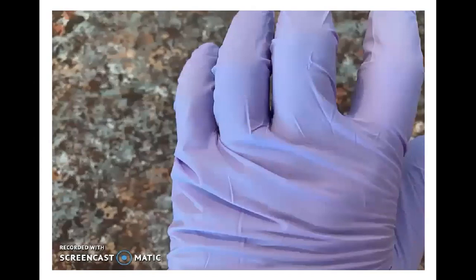And first and foremost, we want to glove up. These are nitrile gloves that I'm wearing in this picture. I put this picture in because I want you to see that these gloves are a little too big for my hands. You want to wear gloves in the laboratory that are not too tight or too loose.